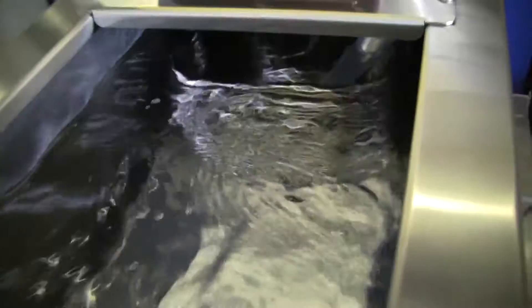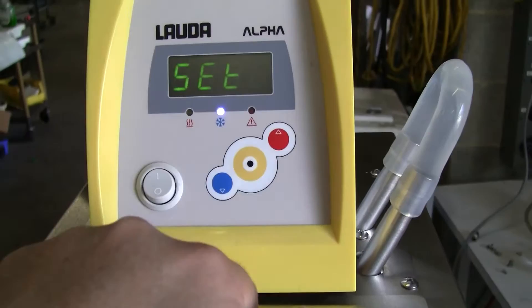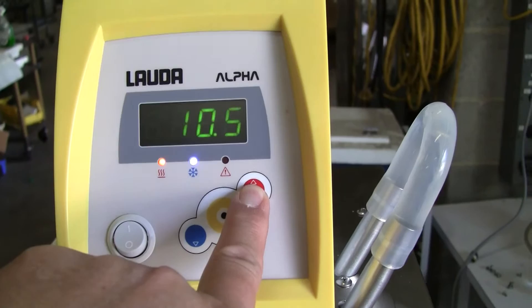The optimized interface to raise the temperature, select, or hold it down.